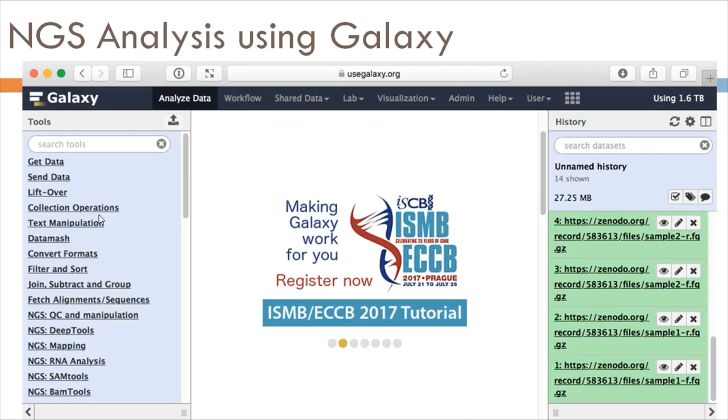Application. This is a cloud application, completely free. All you have to do is go to this website, and then you'll have to create a login for yourself. That's all, right? So it's completely free. It gives you a space for cloud access. This is called the Galaxy Cloud.